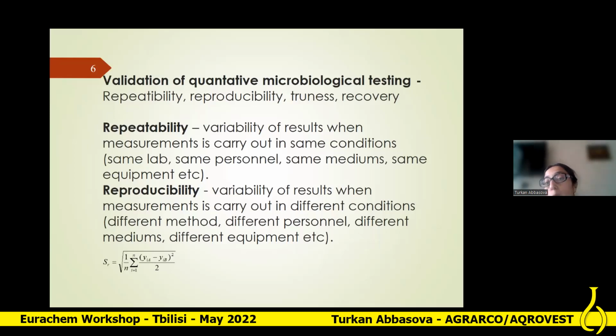Why do we carry out these points? Because when the laboratory gives protocols and test results, the laboratory should have confidence in its testing results.